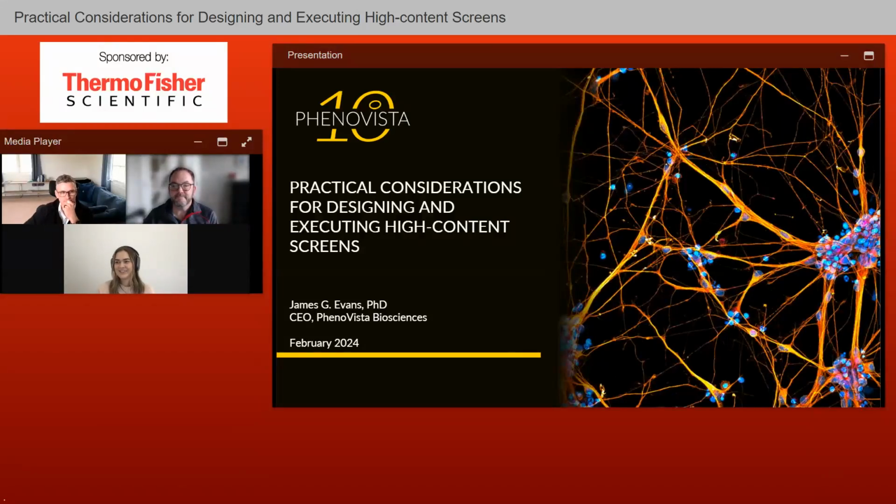Great, thank you. All right, next question here. How important is it to consider cell density as a confound when analyzing the effect of perturbations on your phenotype of interest? Yeah, it's hugely important.